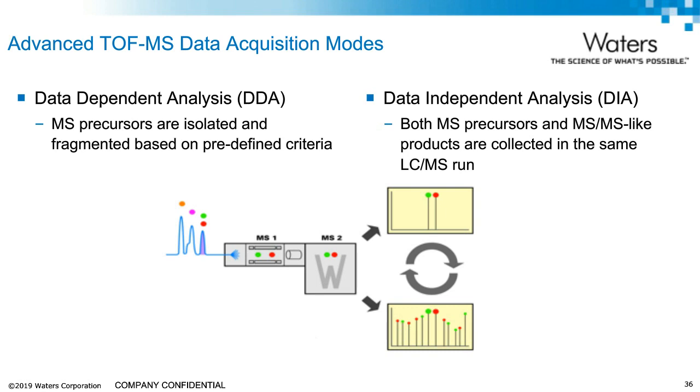In time-of-flight MS, the TOF system cannot physically filter individual ions, so the TOF system records all of the ions at the detector, so some of the experiments run on a quad-based MS system are not available on a TOF system. These include neutral loss, or MRM. But some modern TOF systems are capable of running an MRM-like experiment by only recording masses of interest and discarding the other masses, allowing for both high-resolution, high-mass accuracy data and quantification to be run on the same system if necessary.